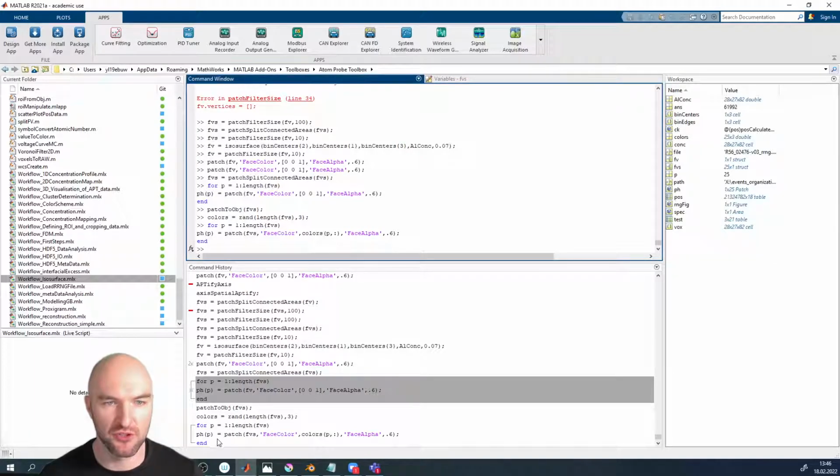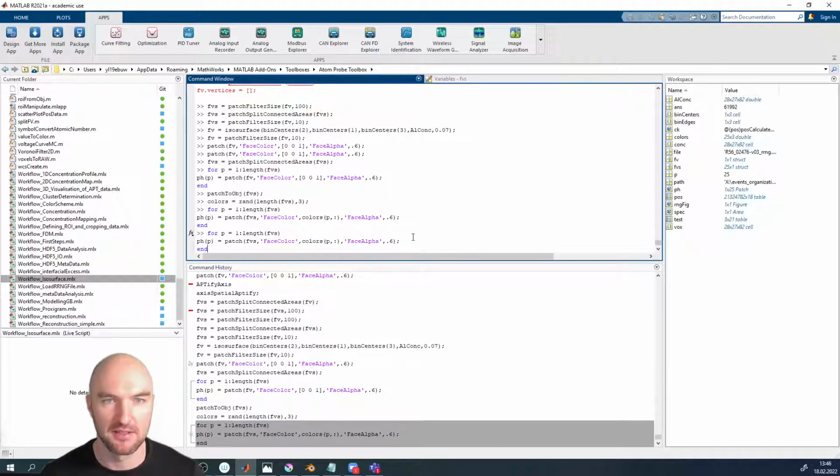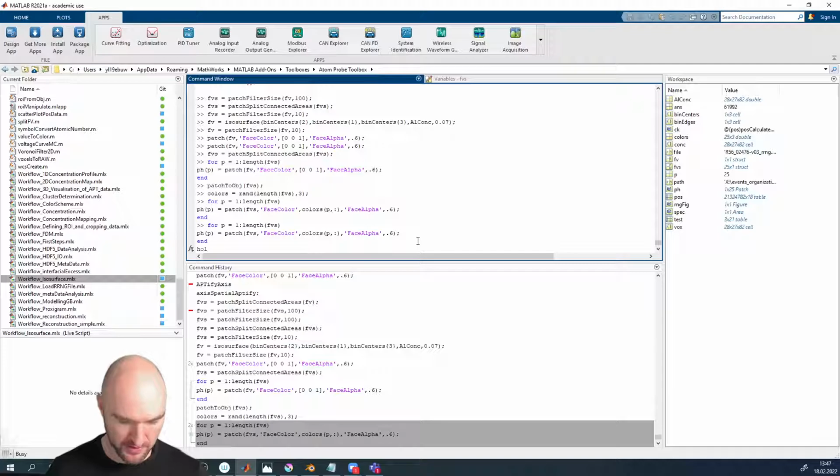And that didn't do the trick, and the reason was I've only plotted the latest one. So we need to go and say hold. Okay. Did it now finally really freeze?